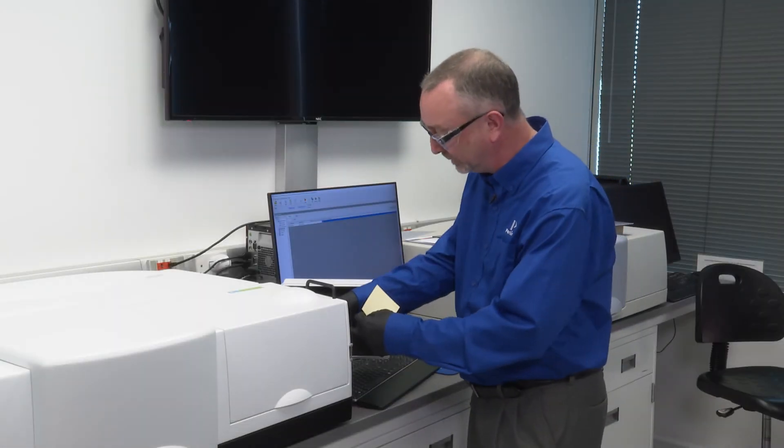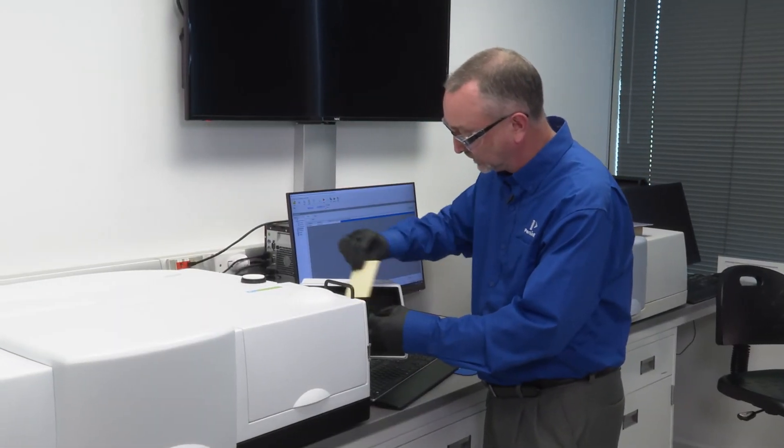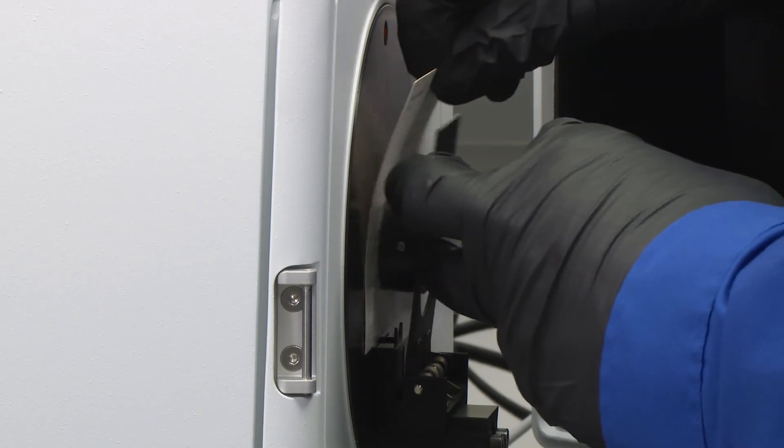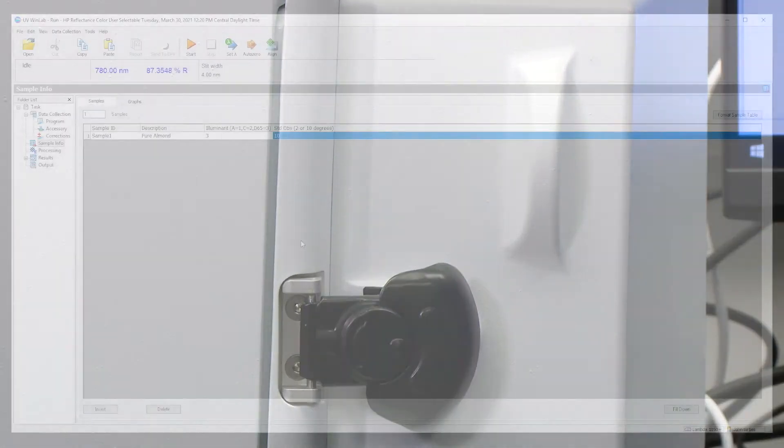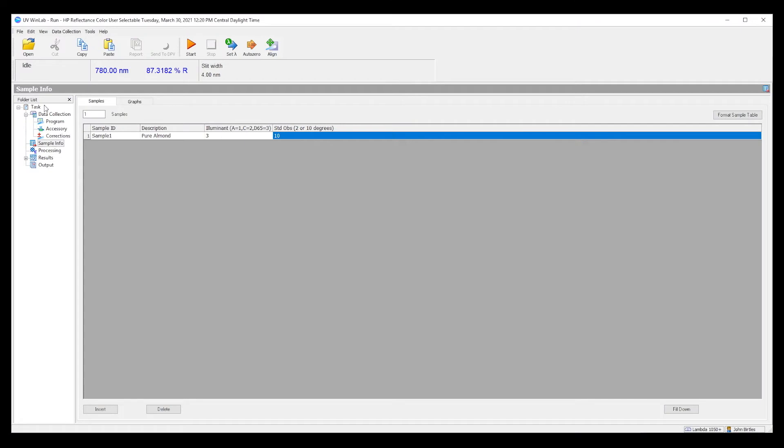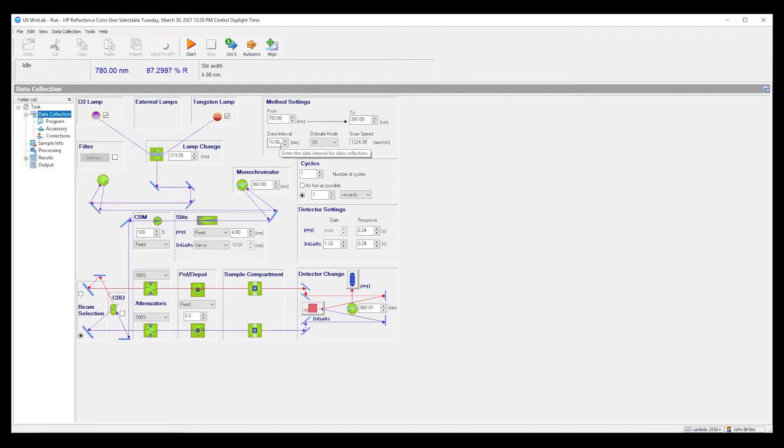The sample is placed at the back in the reflectance pool. As before, we will be performing a percent reflectance measurement from 780 to 380 nanometers. That's the standard wavelength range for color measurements, and the data interval has been set to 10. That's okay. Sometimes 5 is used.